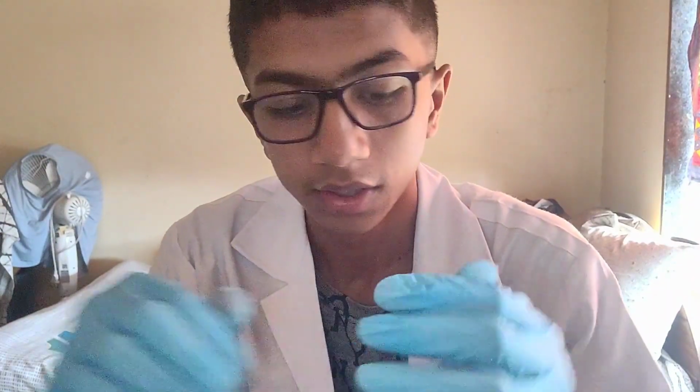I've created three samples. Each one is using ethanol, and these samples are going to be used to test how finely and accurately a thin graphite layer can be applied on a copper foil substrate. So I've created the ethanol samples. Now I only have to create the isopropyl alcohol samples and see how both of these perform.